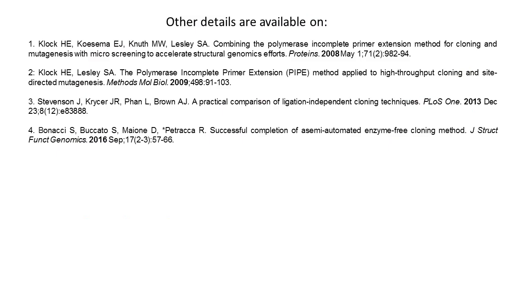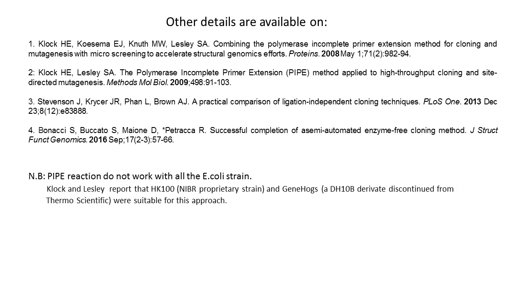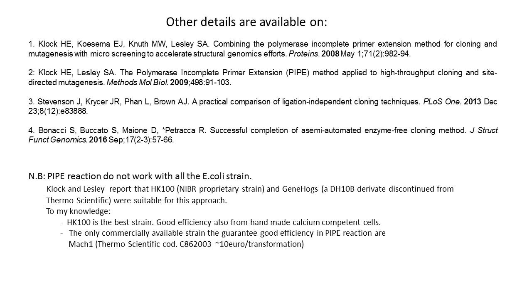So here you can find some nice references for PIPE cloning. What is important to know is that not all the E. coli strains are able to perform PIPE cloning, and to my knowledge, one of the best commercial strains for PIPE cloning is Mach1 from Thermo Scientific.